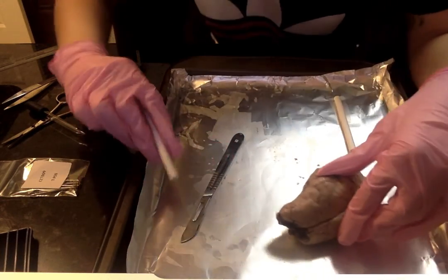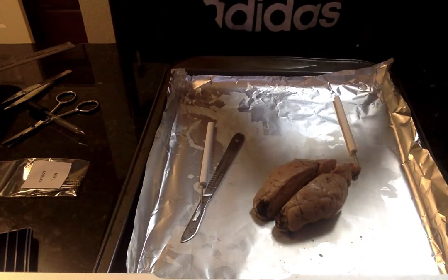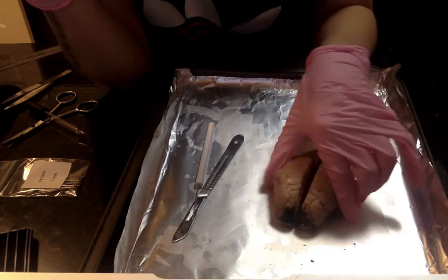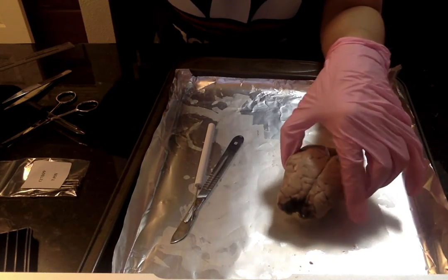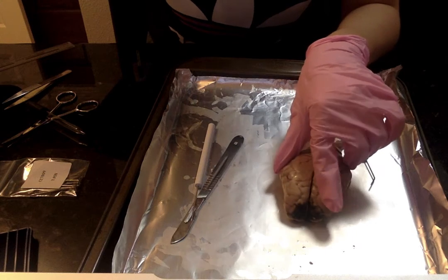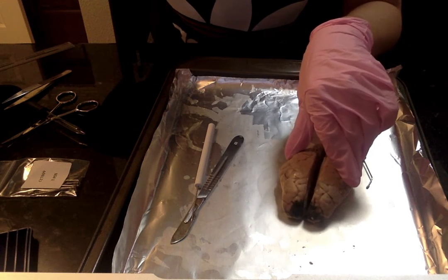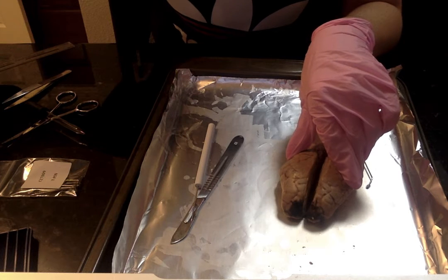There's a lot. All over the brain, there's gyri and sulci, but it's more on top where the cerebrum and all of that good stuff is.